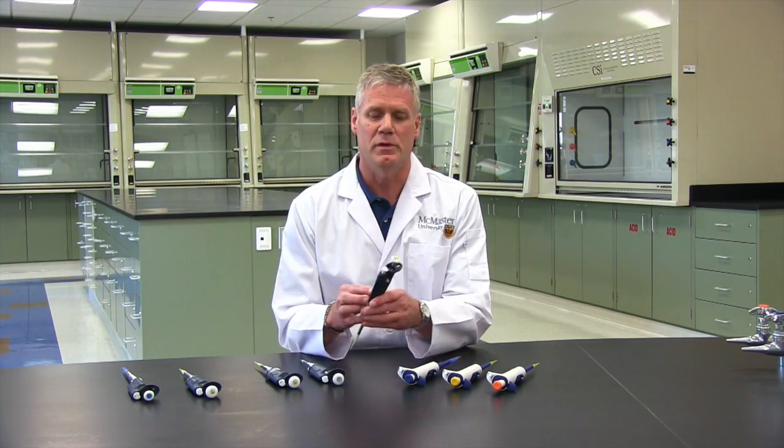This training video will demonstrate the proper technique for using micropipettes. There are many different manufacturers of pipettes and many different models to choose from, but they all operate under the same principle, which is piston-driven air displacement.